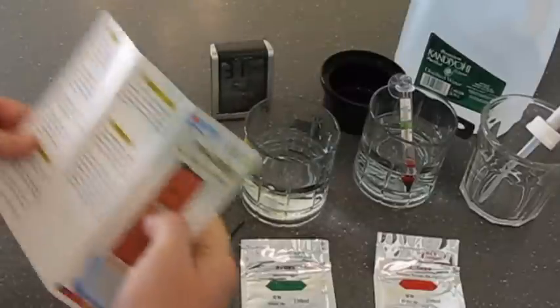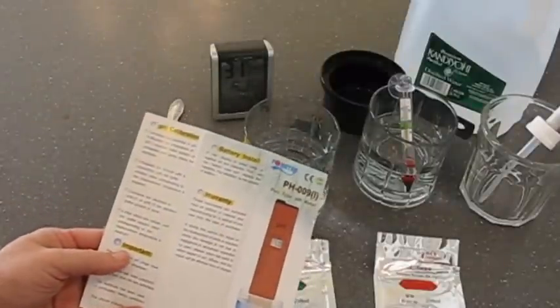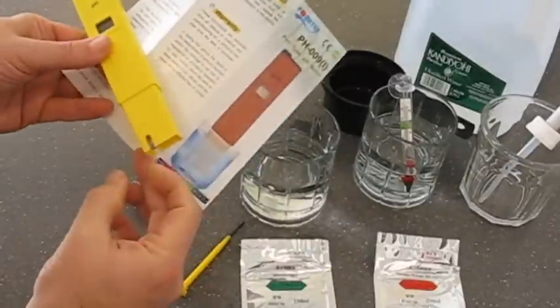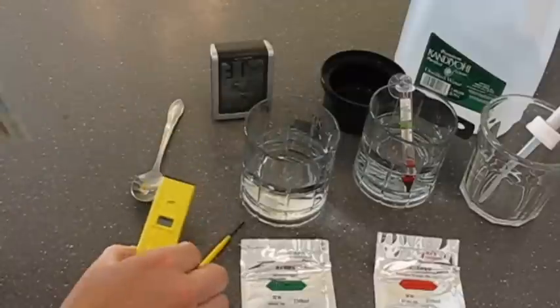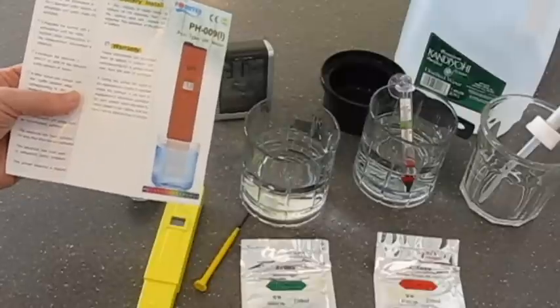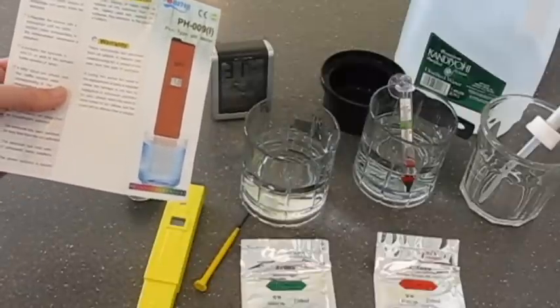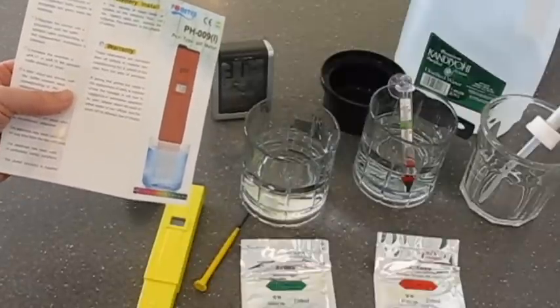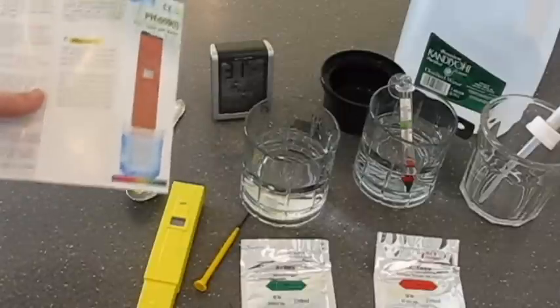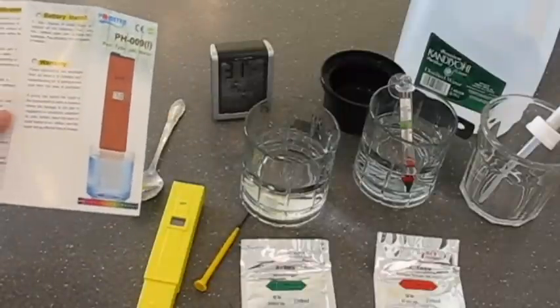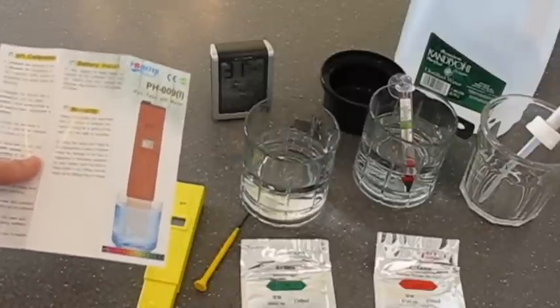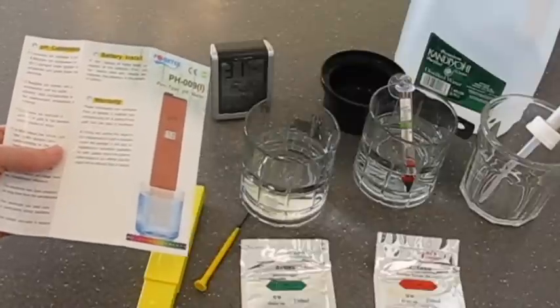But one of the instructions is that you immerse the electrode, which is this little glass ball here. You immerse the electrode in the pH 6.86 under a temperature of 25°C, 25 degrees Celsius, which is 77 degrees Fahrenheit. pH level is different depending on the temperature of the water, and so this is an important calibration step.